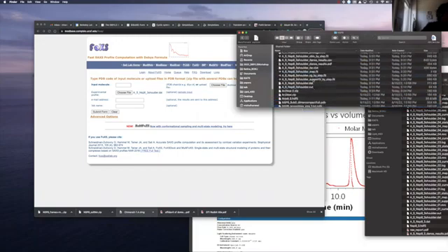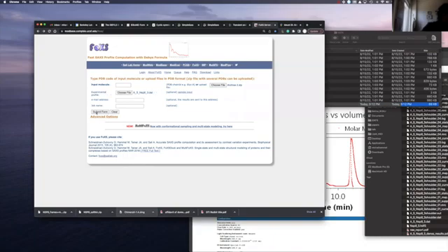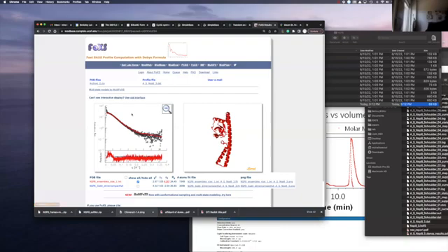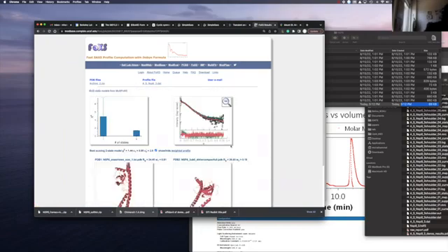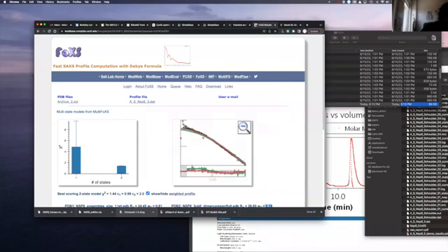So instead of the NSP8 shoulder, we're going to take the NSP8 peak and do exactly the same exercise. This gives you an idea of how you can do this in a fast way. Obviously you want to get rid of those 2.0 values at the beginning. In both cases, we improve the chi-square by adding a mixture of, in this case, about 81% and 19% of monomer and dimer. Most importantly, it really improved the small q region. So you can see here a significant improvement by using a few percent of the dimer.